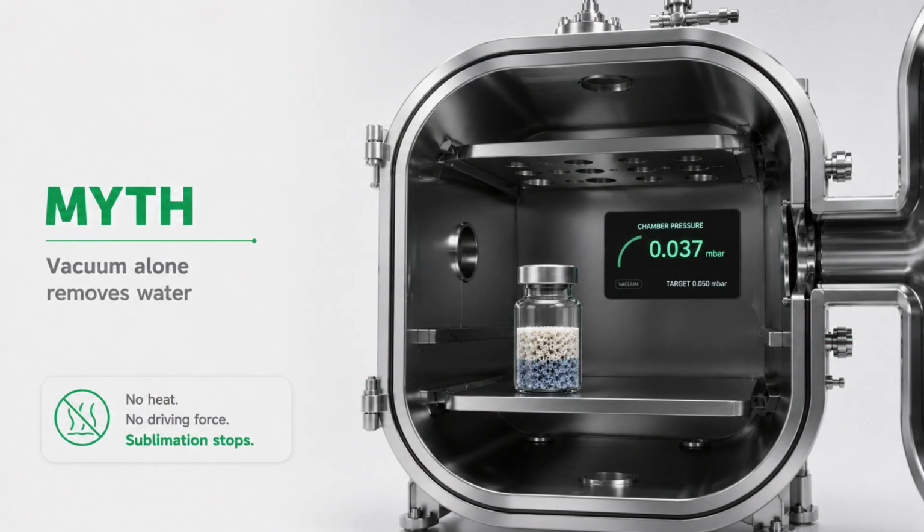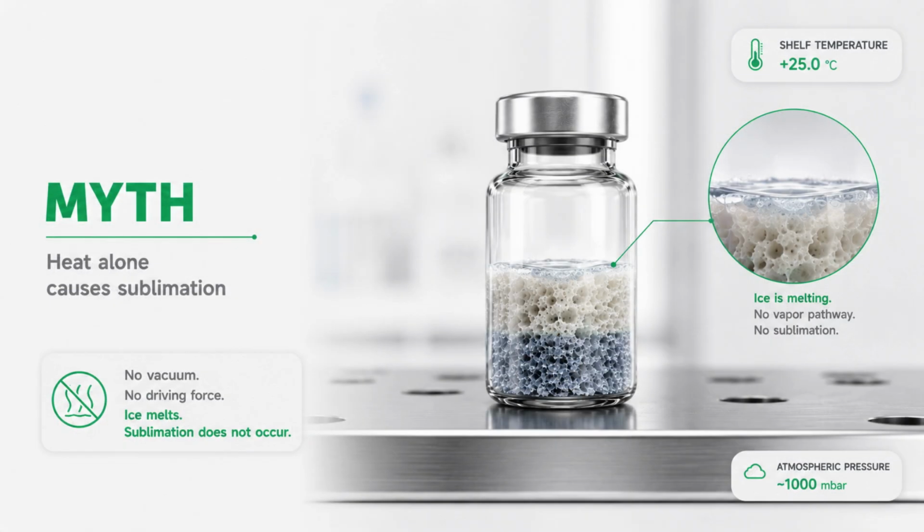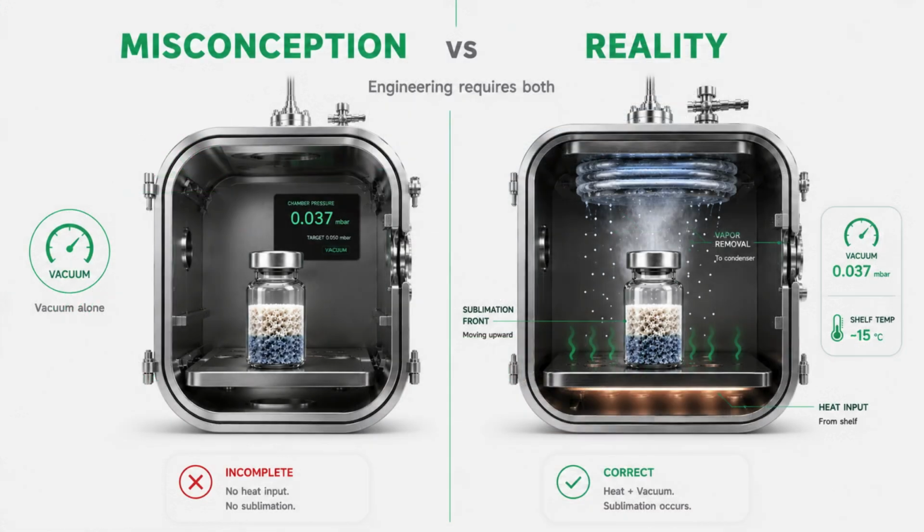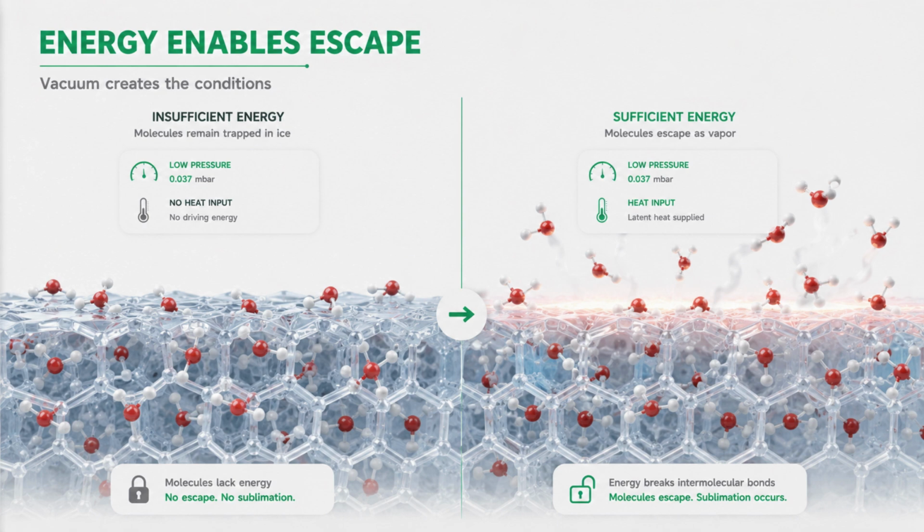A common misconception is that vacuum alone removes water. In reality, vacuum creates the right conditions, but heat provides the energy needed for sublimation. Heat alone is not enough either. Under normal pressure, ice simply melts. Successful pharmaceutical lyophilization always requires controlled heat and deep vacuum working together.